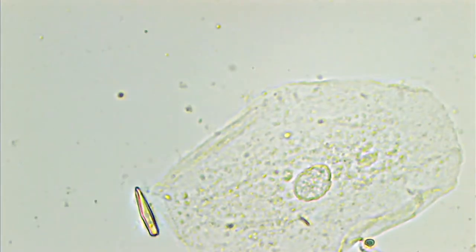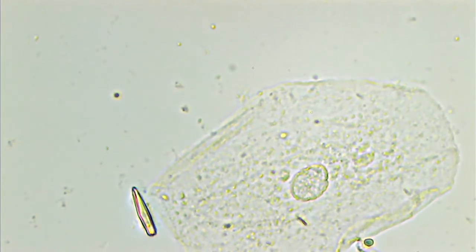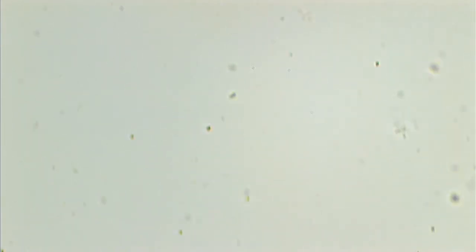Then I took a cheek swab hoping to get some epithelial cells — and that delivered. They're nice and flat, and you can actually see the nucleus there in the center. Wow. This is the raw view, unstained and unpost-processed. This is amazing.